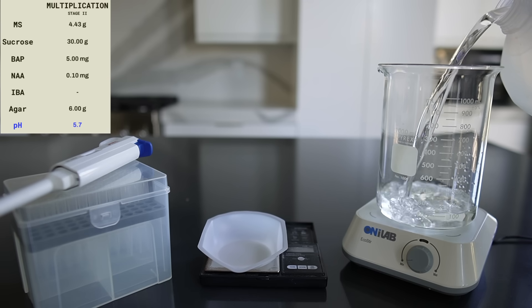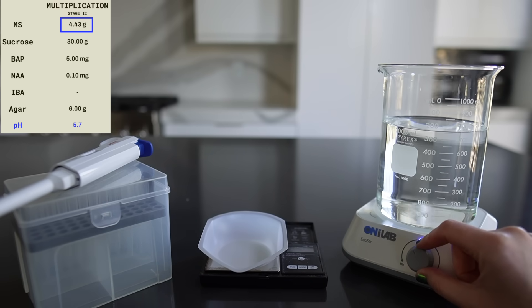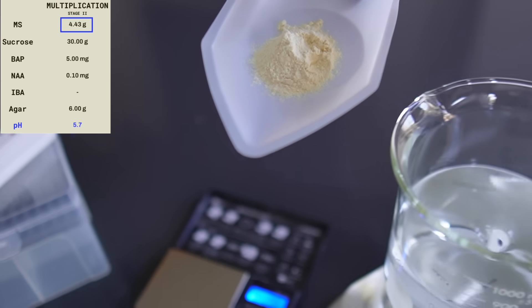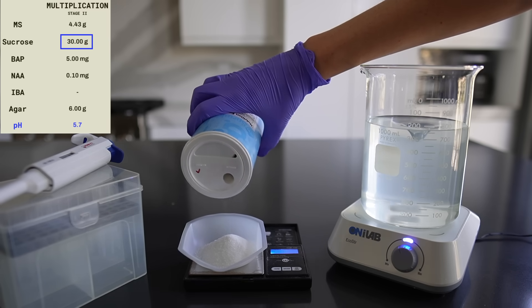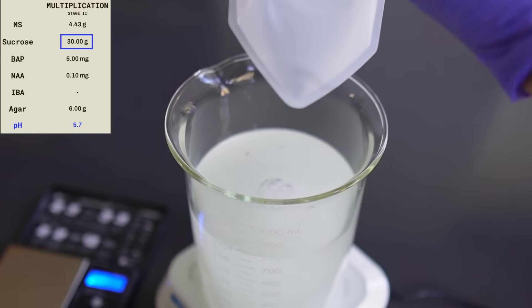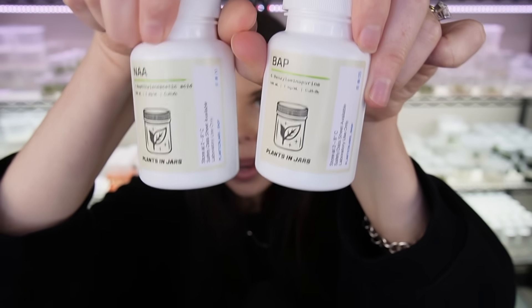To make one liter of Monstera Multiplication Media, we're going to start with 800 milliliters of distilled water. First, I'm going to add 4.43 grams of Murashige and Skoog. MS is our basal medium and includes all the nutrients that plants in vitro need to survive. Next I'm adding 30 grams of sugar — plants in TC don't photosynthesize like a mature plant does, so the sugar is an energy source. Then we need to add our hormones, BAP and NAA, which control how the plants grow while they're in tissue culture.